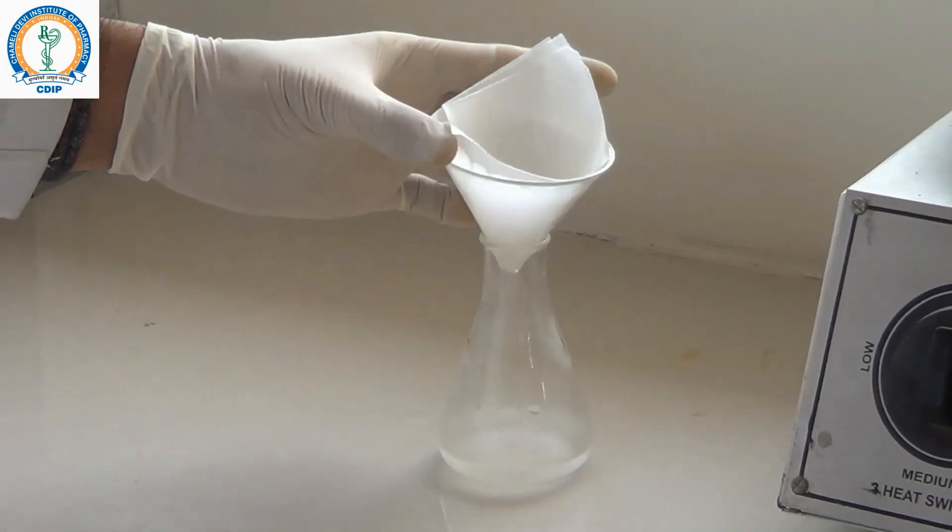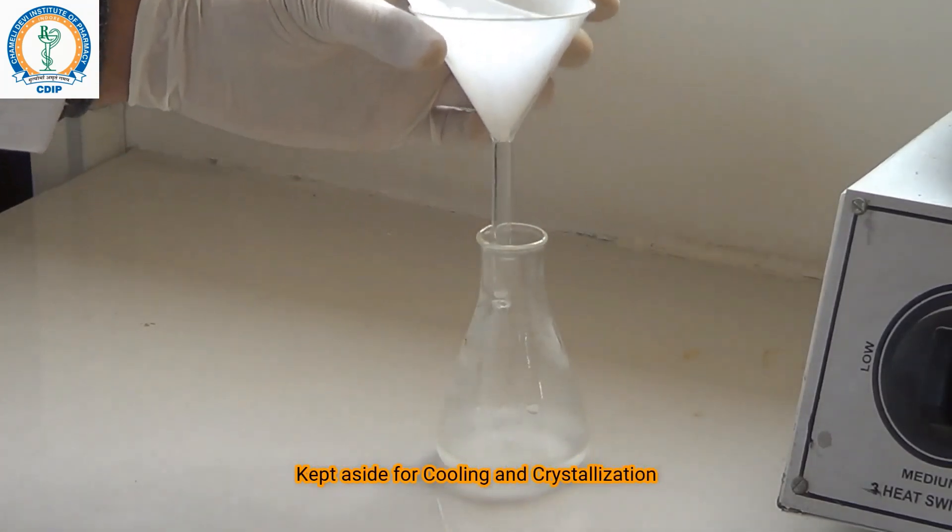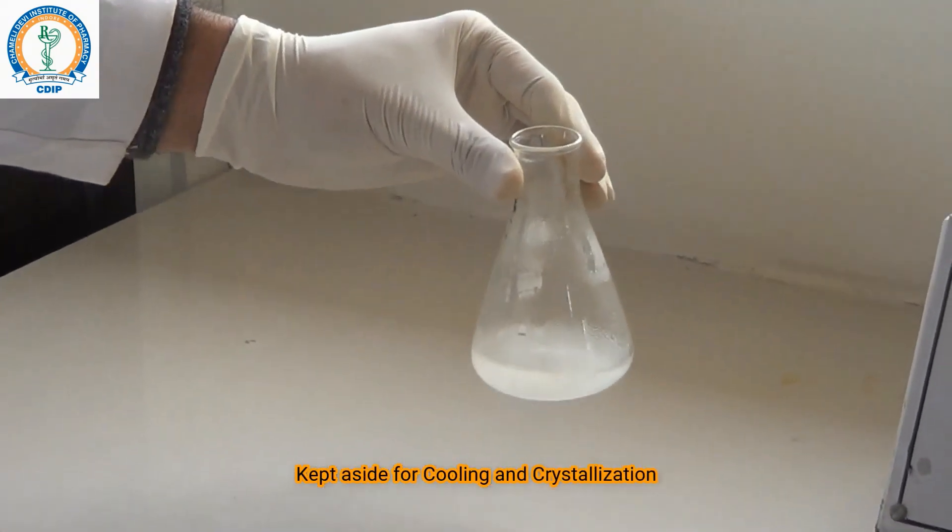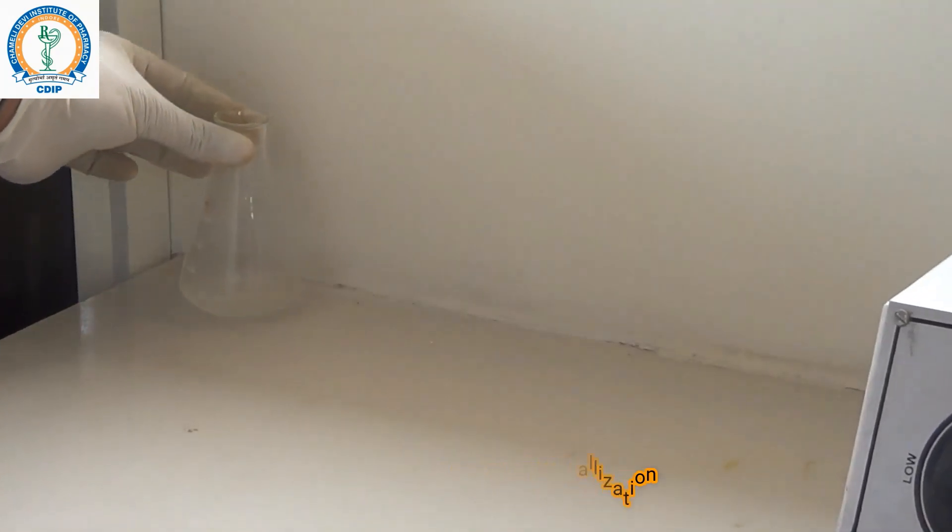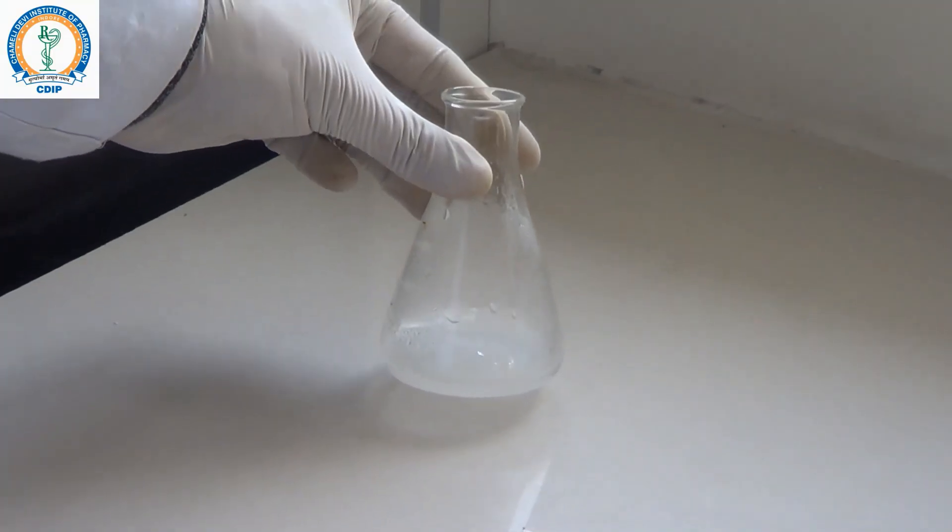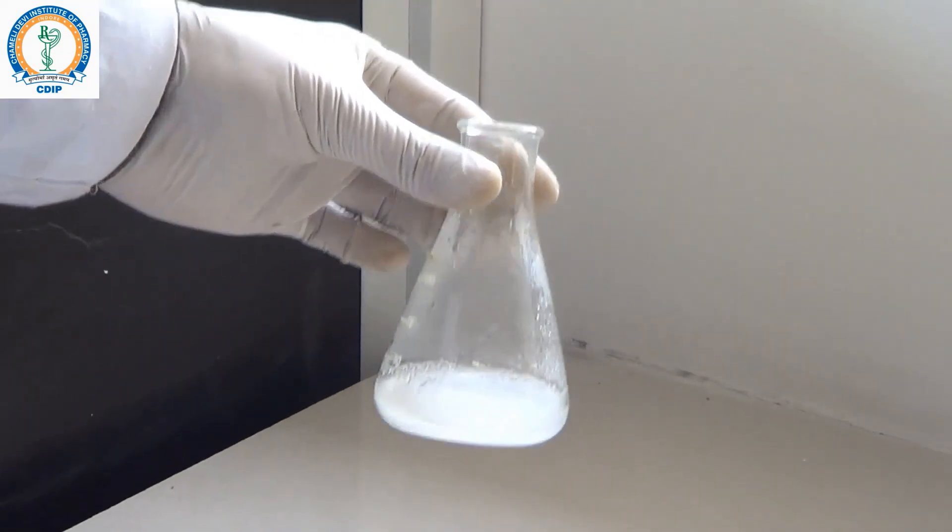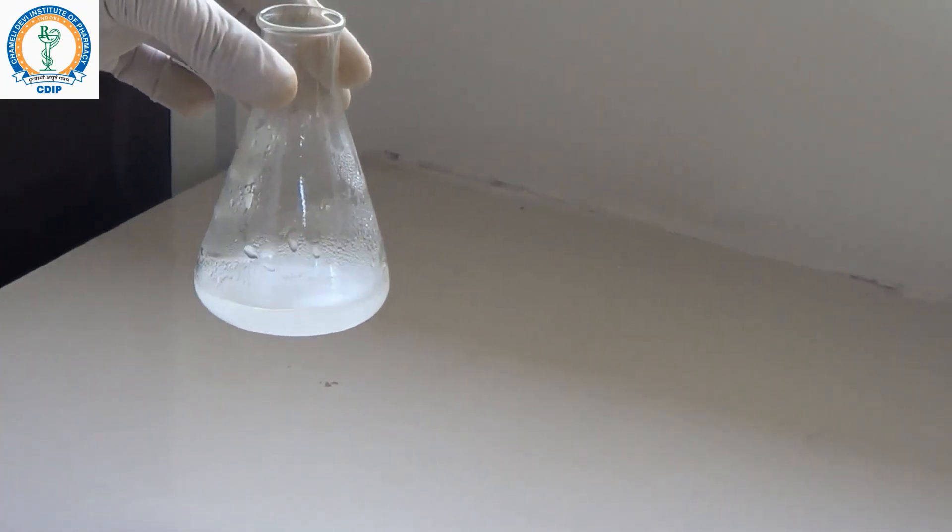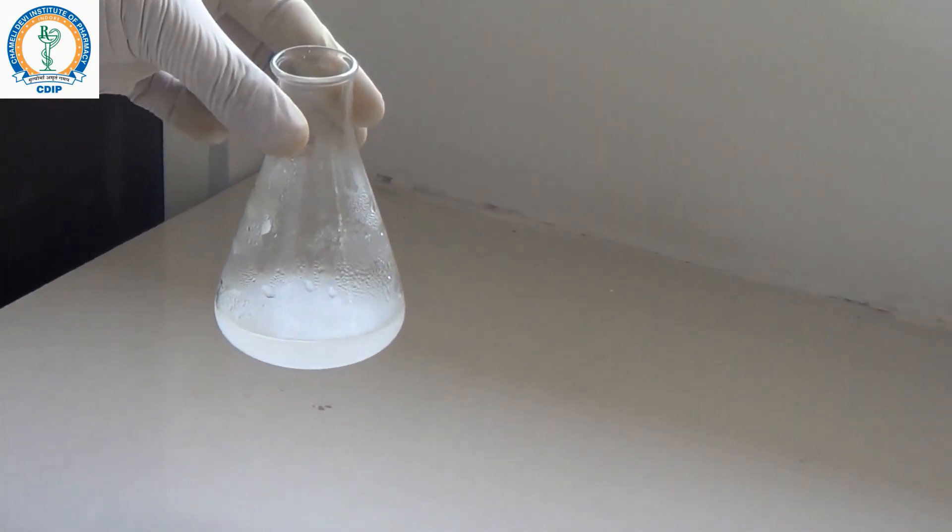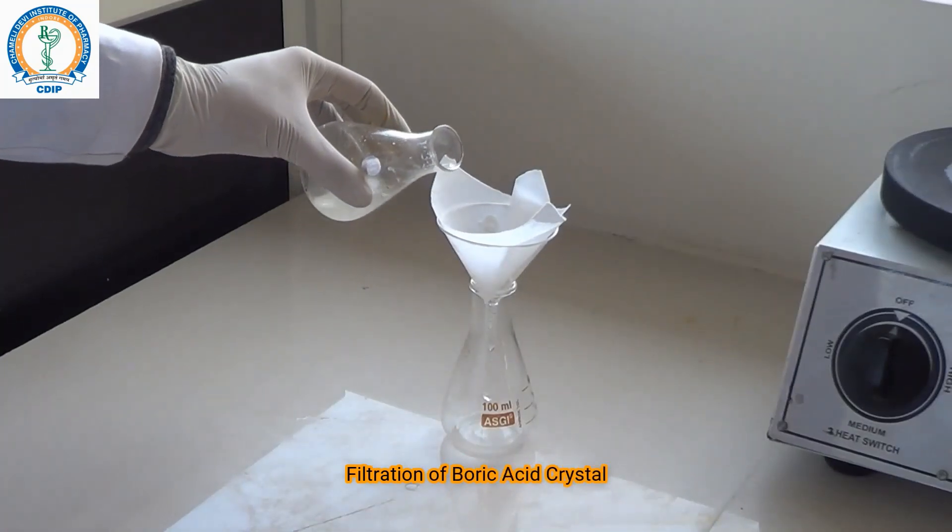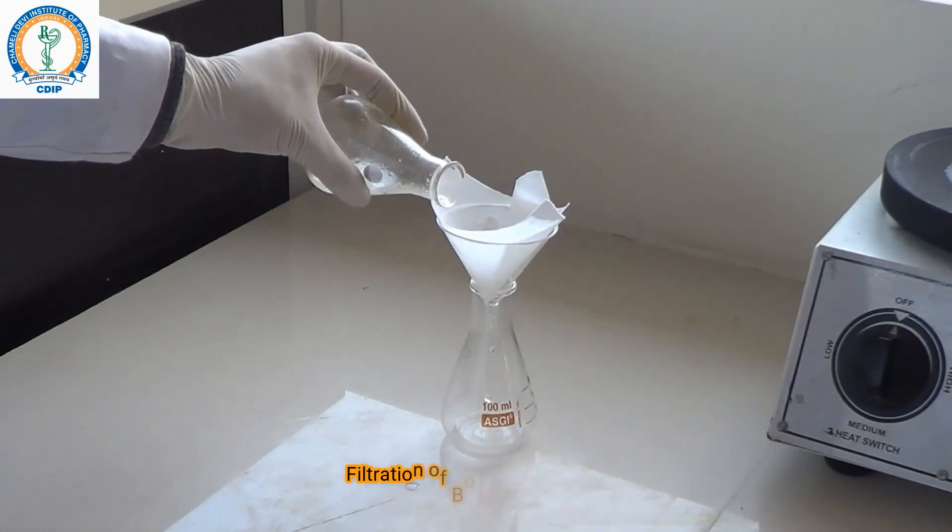Now after filtration, keep the conical flask for 30 minutes for the formation of crystals. After cooling, you can see the formation of crystals into the conical flask. After complete crystallization, filter out the crystals using Whatman filter paper.